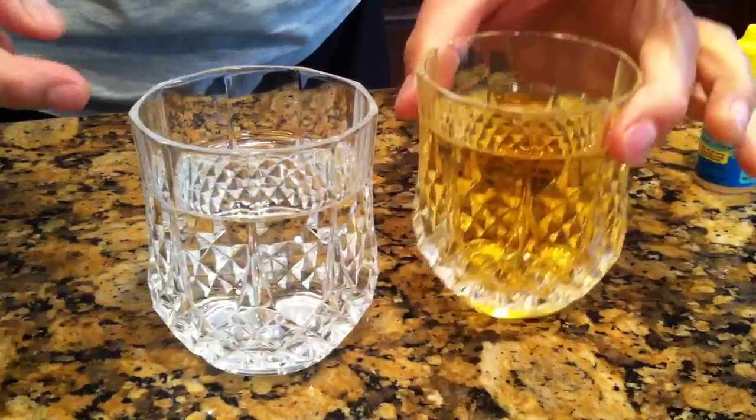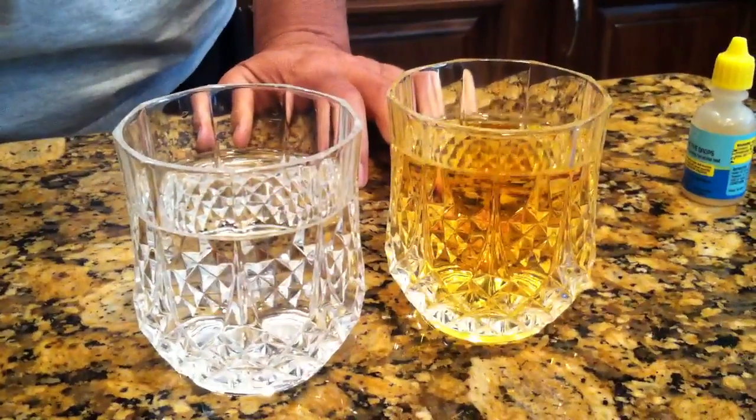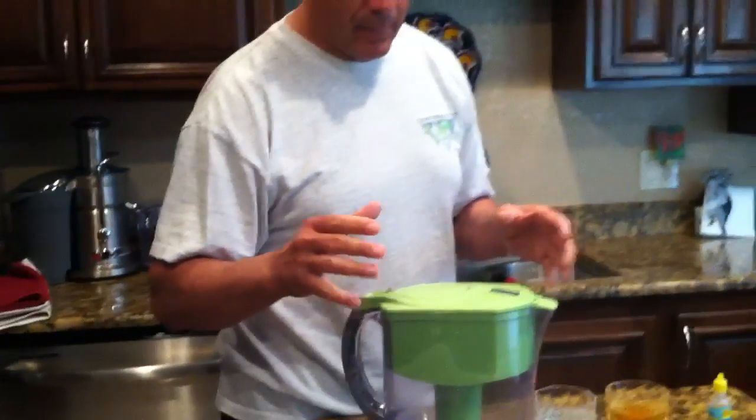Look at the difference in color — this one has tons of chlorine in it coming from the tap over there at the kitchen faucet, and this came from this Brita filter. Now I'm not promoting Brita filters — you can get any kind of different filter, under-the-counter filters, or filtered water.